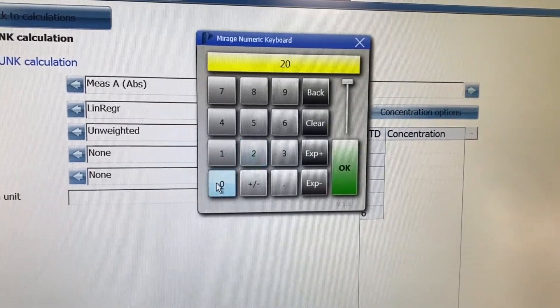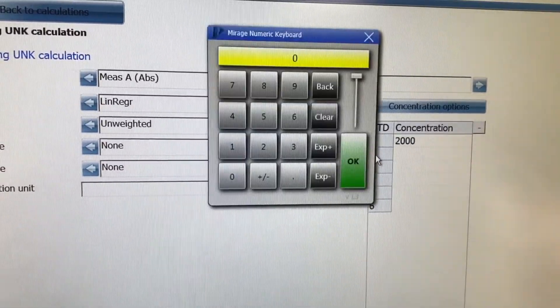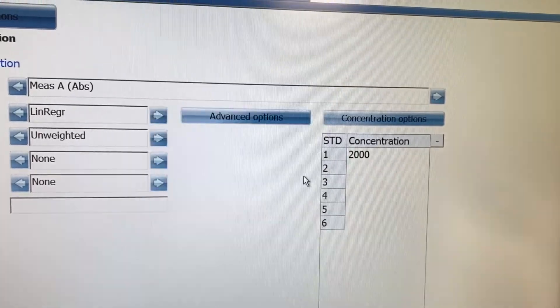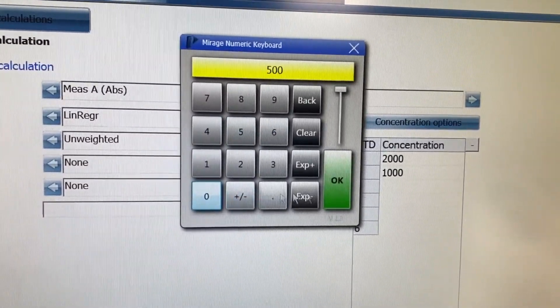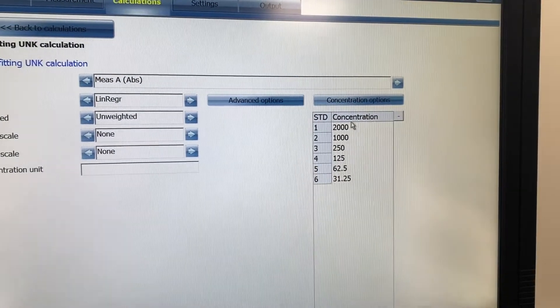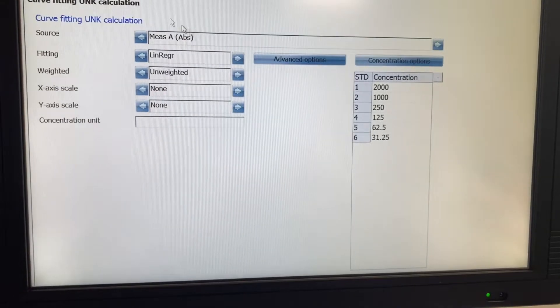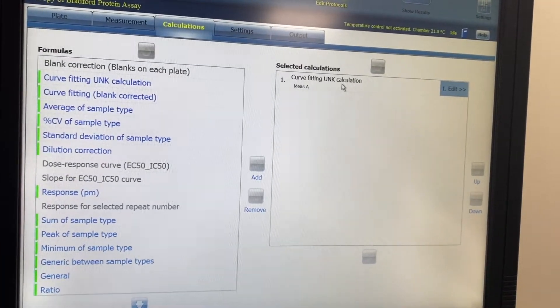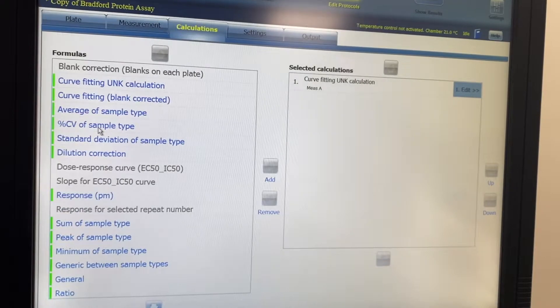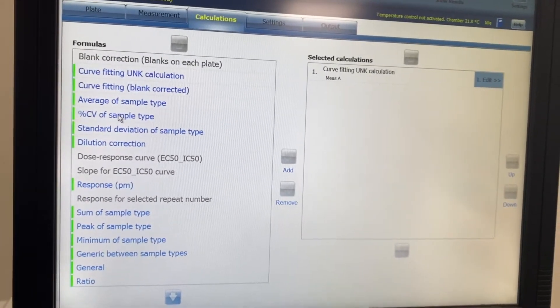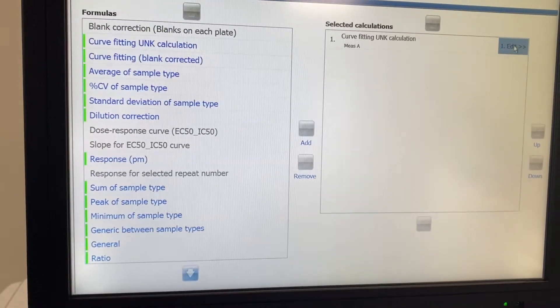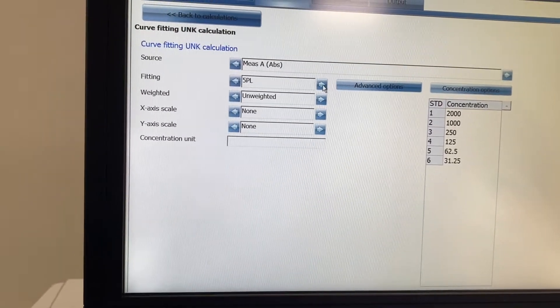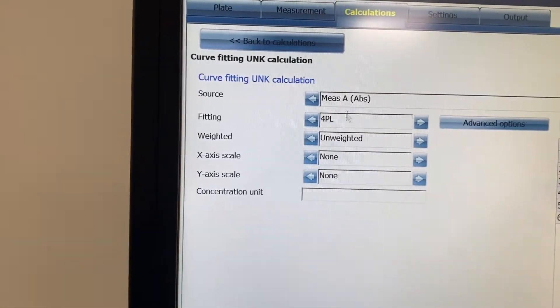Use the on-screen keyboard if the physical keyboard isn't working. Enter your concentrations — for example, 2000 picograms, and if you're doing one-in-two dilutions the next is 1000, and so on. Just fill in all your standard concentrations. Then go back to calculations — now the instrument will be able to calculate the standard curve. You can also select the kind of curve fitting you want.